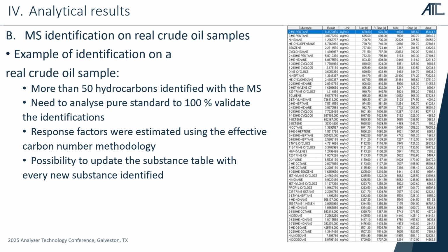And even if the GCMS is a reference method for VOC identification, as I mentioned, the linear alkanes have a quite similar mass fragmentation. So if we want to be sure, we need to alternate between the liquid standard injection to validate the retention time and then the real sample. And then we have 100% confidence in the identification between the liquid standard as a reference, which can be injected anytime because it's available on the system, and the GCMS identification.